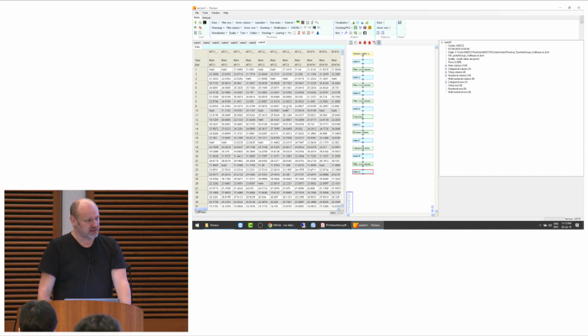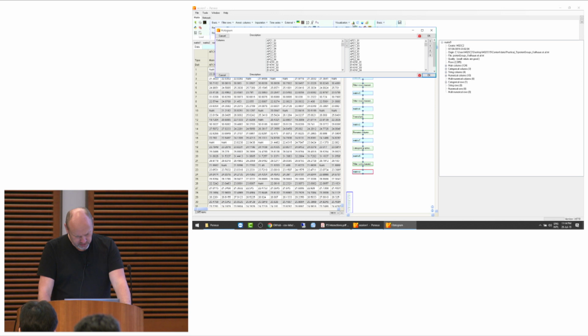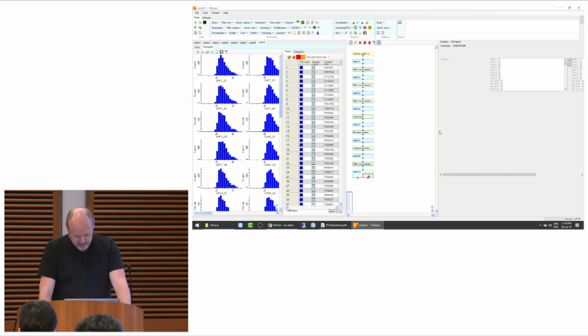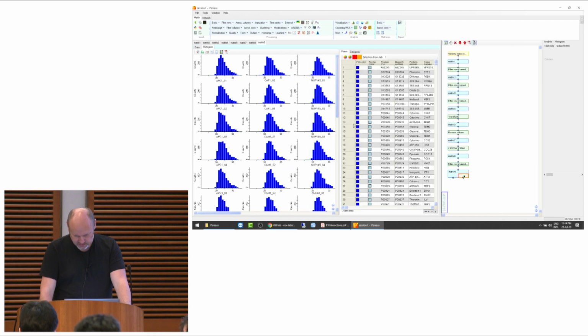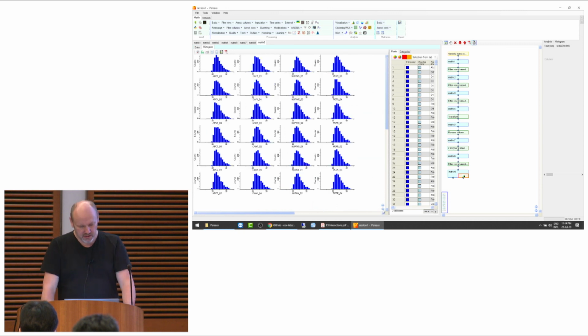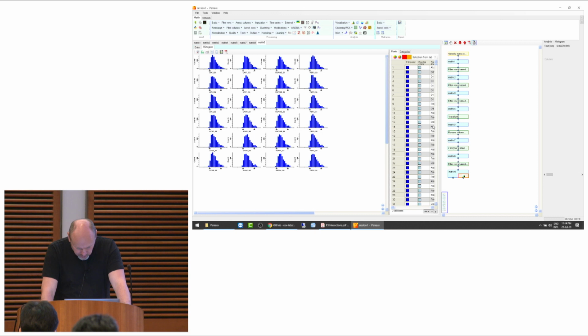Right, so now we have the matrix that we want to work with. And we could already look for if the data is okay, looking good, for example, by looking at the histograms of the intensity. So maybe let's do that. The histograms are here. Do all of them. Maybe let's make the space a little bit bigger. So that is basically the step where you really want to sit at a big desktop monitor. That's much easier than on a laptop. But let's try to do our best here. So maybe let's decrease the size a little bit.